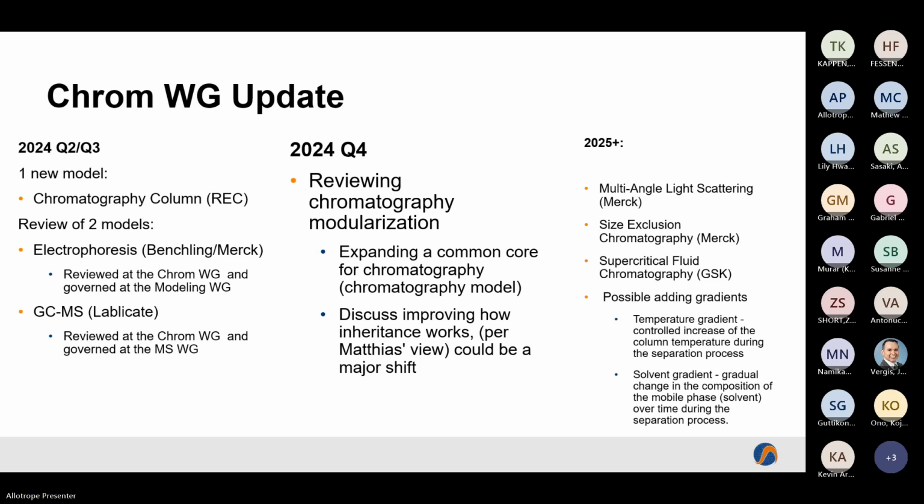We're now mature enough that we want to consider that, and we're also finding there are other techniques that need that kind of data. So we're looking to see if we can build a pattern to, again, do that consistently across both chromatography and the other techniques that have this kind of data over time, settings over time, I should say. We have data over time already, but settings over time is a slightly different concept in the ontology.